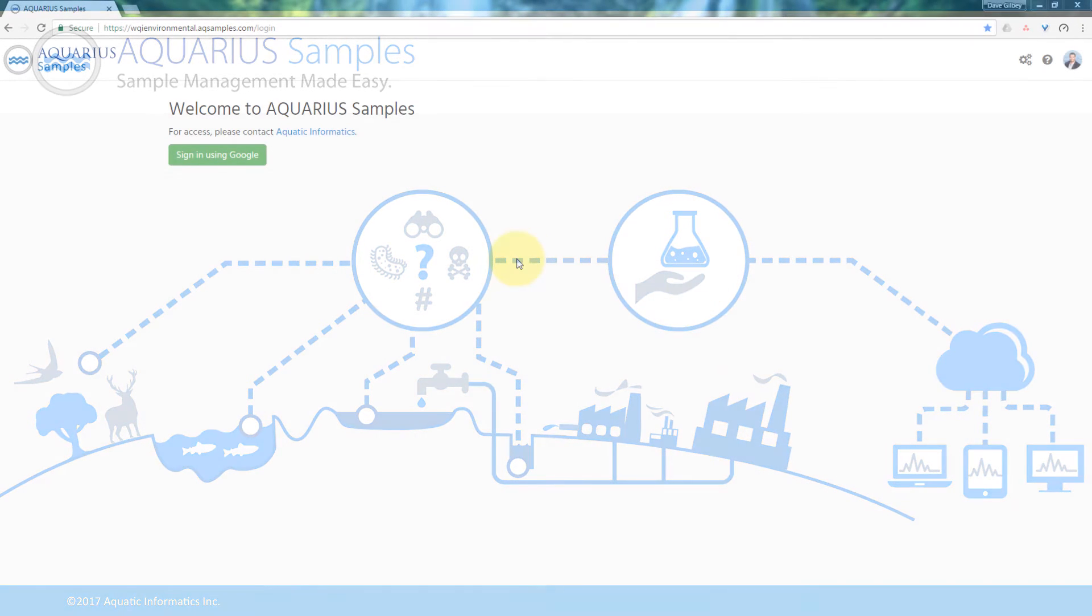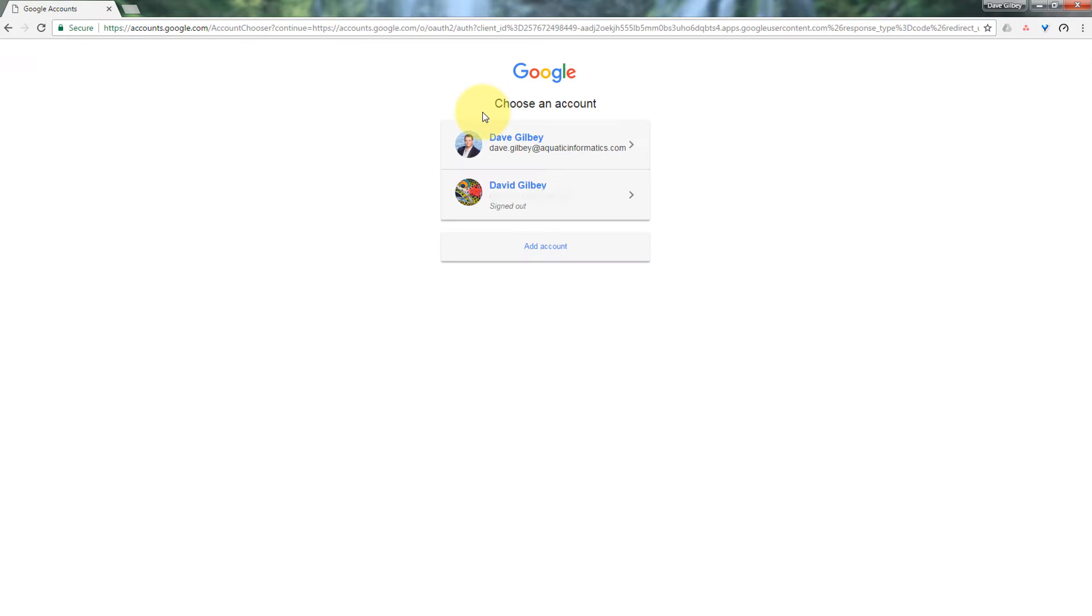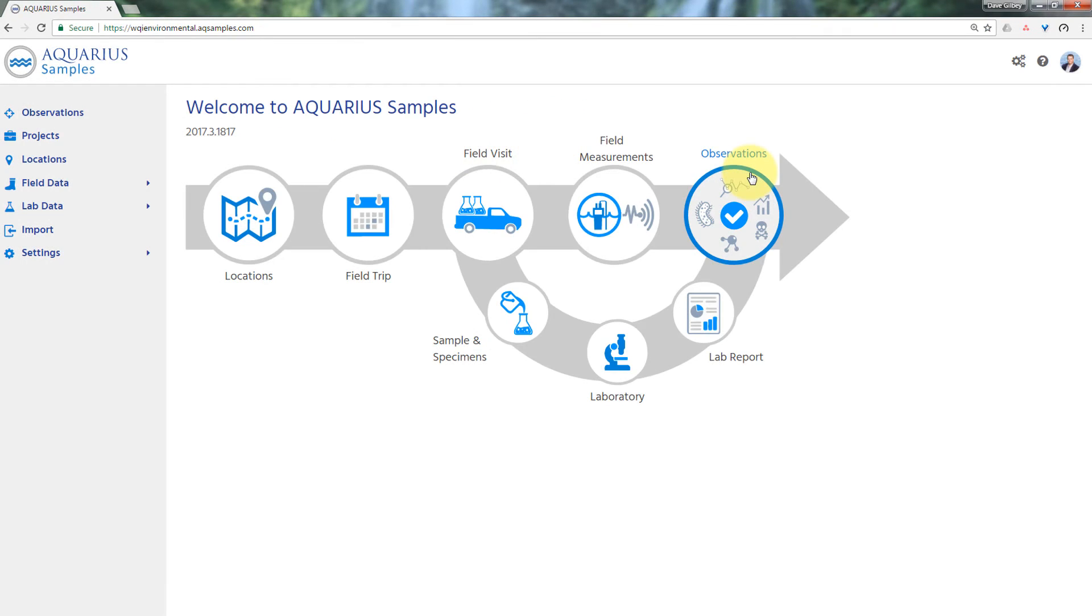First today, what we're going to do is we're going to go through getting into Aquarius Samples and signing in via my Google account and showing some generalized workflows on the initial landing page.